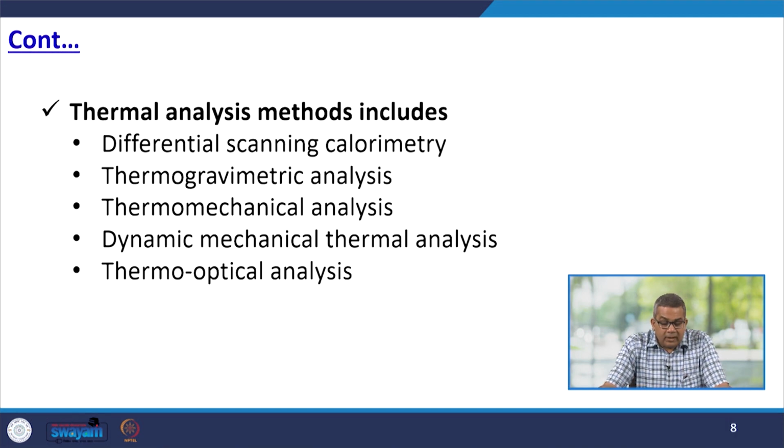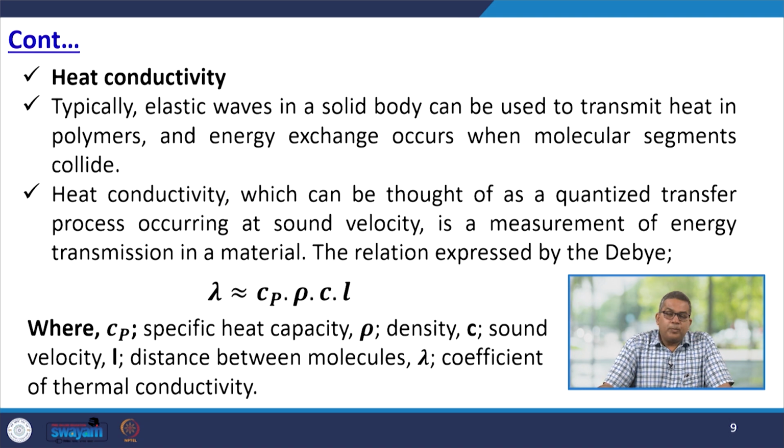Now, the thermal analysis methods include differential scanning calorimetry, thermogravimetric analysis, thermomechanical analysis, dynamic mechanical thermal analysis and thermo-optical analysis. So, before we go into the detail, let us talk about the heat conductivity.